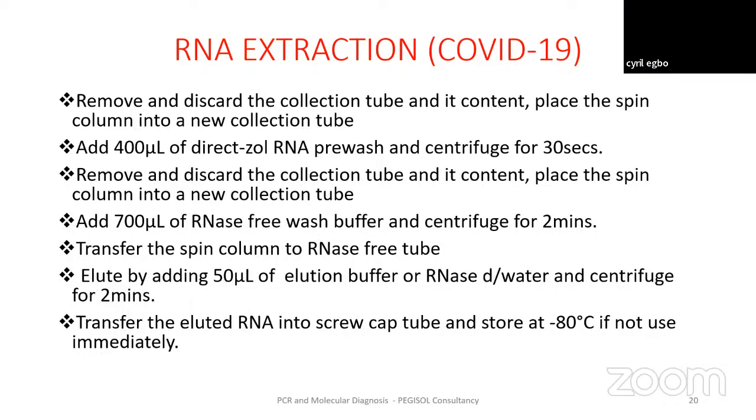or maybe if you have a rack that can preserve that collection tube, you will store it, depending on the time interval that you want to analyze. So this is how to extract RNA.